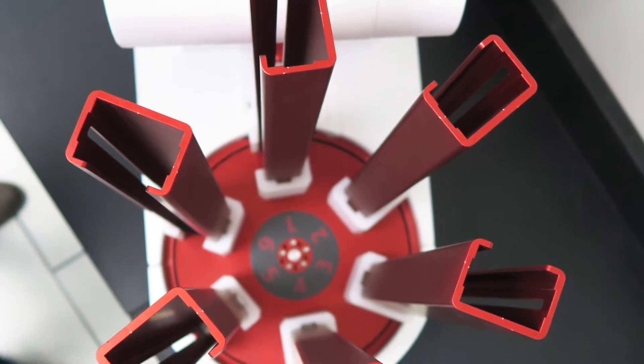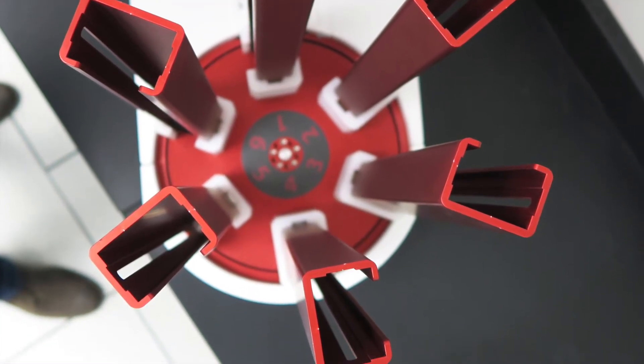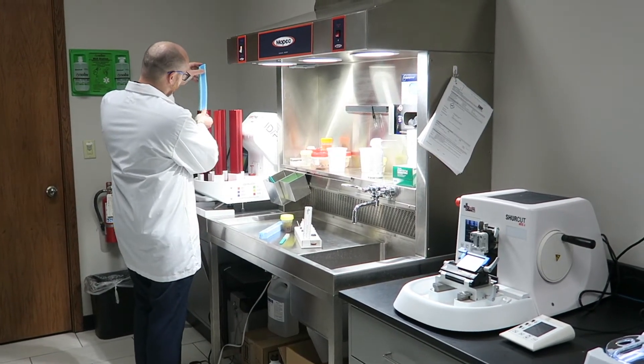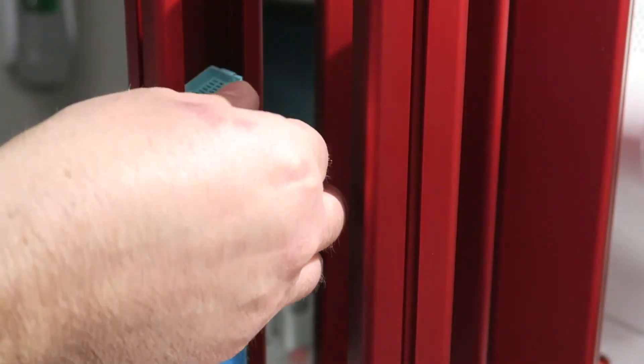The six cassette magazines each hold up to 60 cassettes for a total of 360 without refilling. Cassettes load easily into each magazine and come in handy pre-taped stacks for easy dispensing. All the operator does is fill and pull.